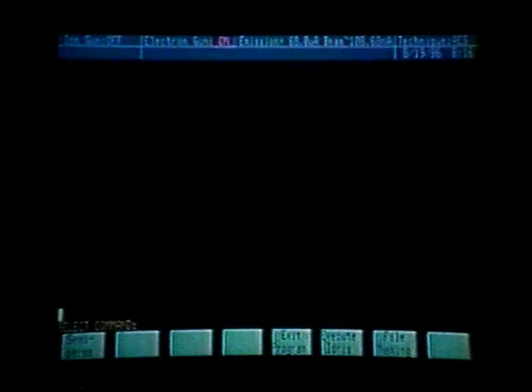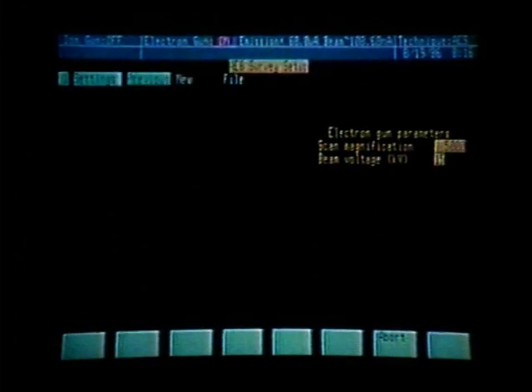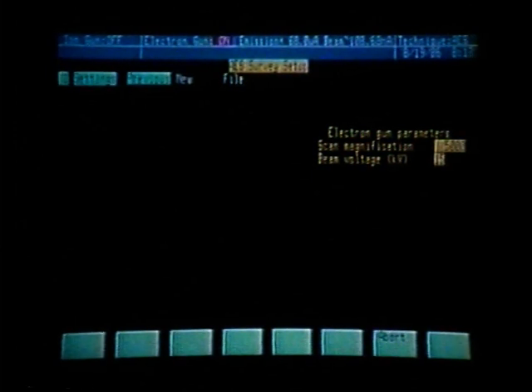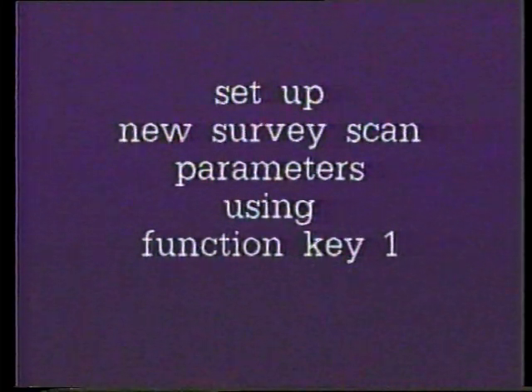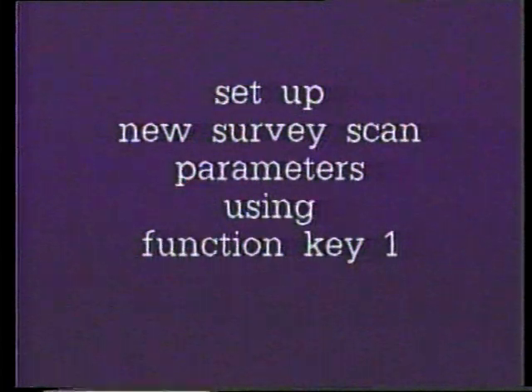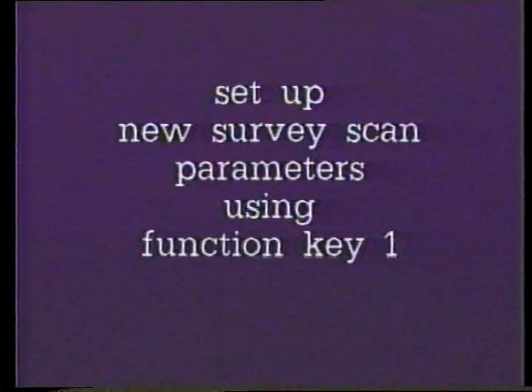Now that we have the areas selected, let's set up for survey scans to identify the major elements. To enter the survey menu, we hold the shift key down and strike function key number 5. That allows us to choose either previous settings, define new settings, or if we had a survey scan stored on the data disk, we could pull that file name up. What we want to do is set up new survey scan parameters, so we'll toggle to new using function key number 1 and then enter.